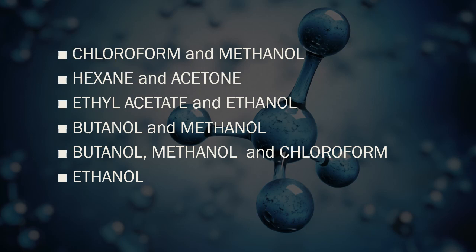Let's take a look. Your hexane can also extract lipids and fat-soluble vitamins. Your diethyl ether is for general purpose extractions.